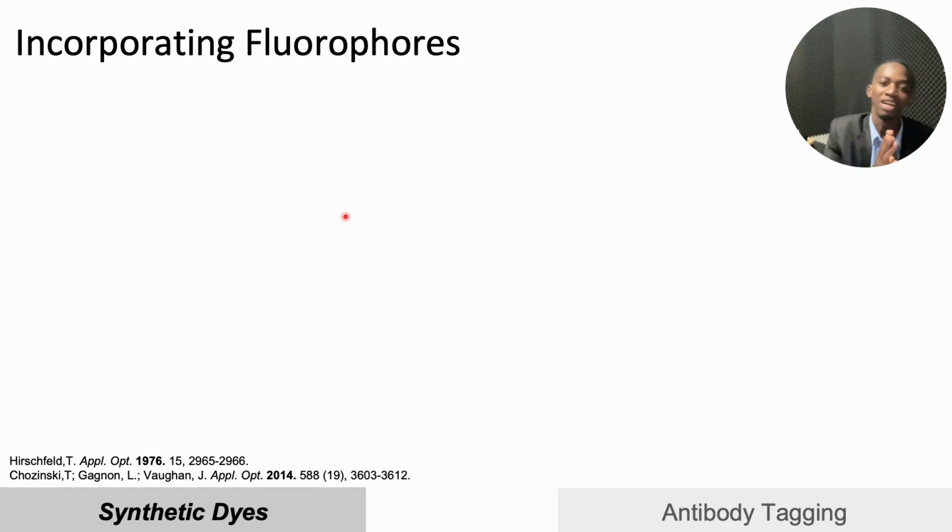All right. Because you're viewing a very small subject, you need a way of telling it apart from the neighboring objects. For example, think of a case where you're trying to view a mitochondria. Well, you need a way of telling it apart from all the other contents of the cell. And that is commonly done by incorporating fluorophores. Now, fluorophores are fluorescent substances that you can attach or that can bind to non-fluorescent objects under study, and that makes them glow or more visible under the microscope.